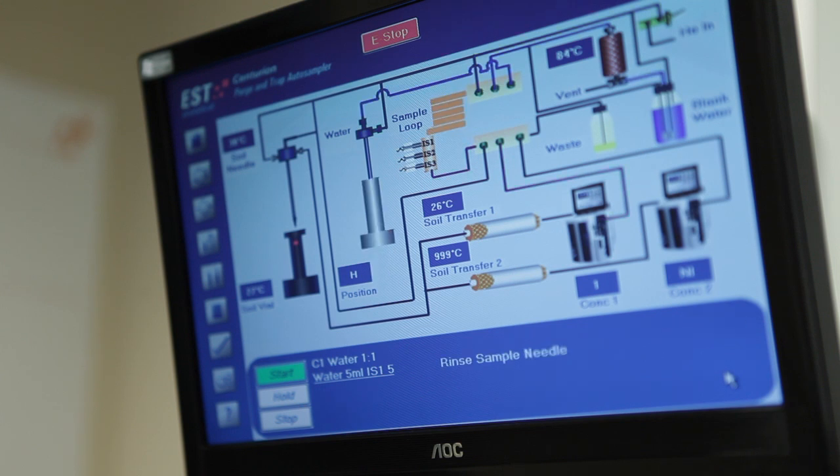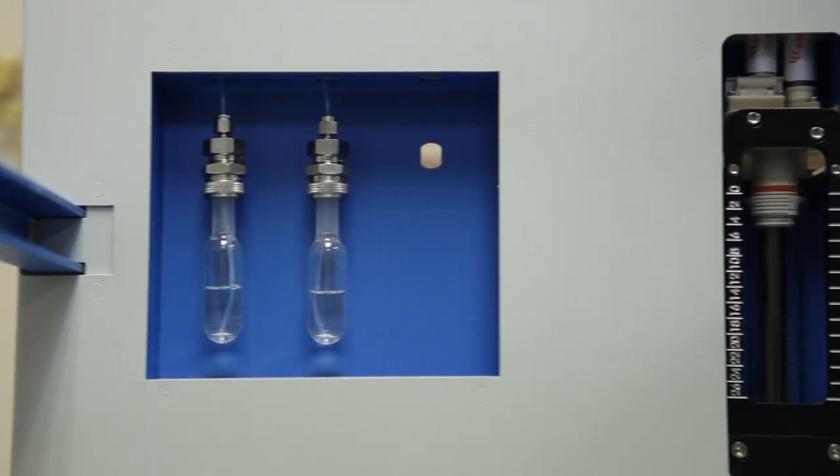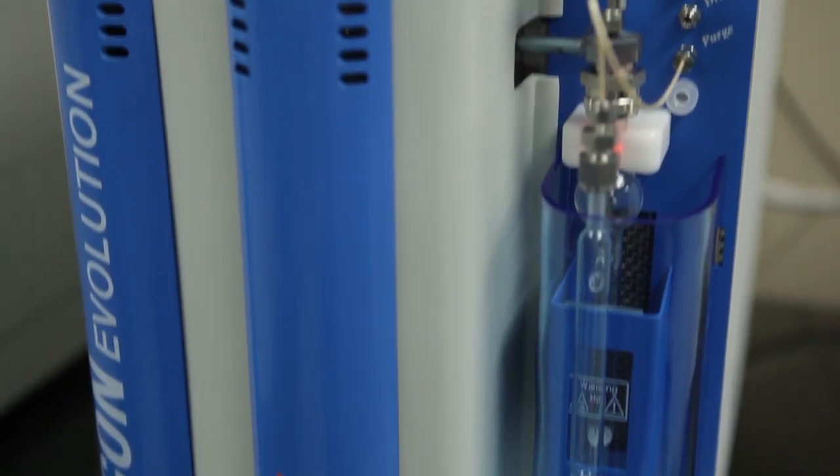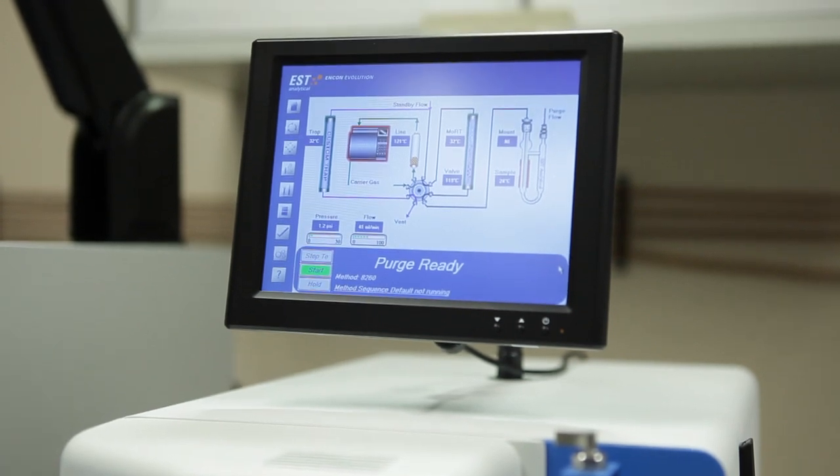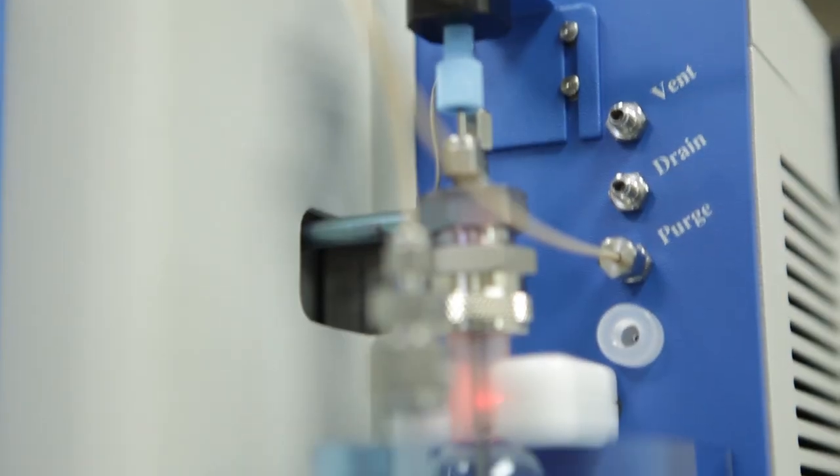Units are shipped with a 5 microliter addition but this can be varied. Water samples are transferred to the ENCON concentrator where they are purged per the EPA method. Moisture removal takes place during purge in the moisture reduction trap which is before the sorbent trap.